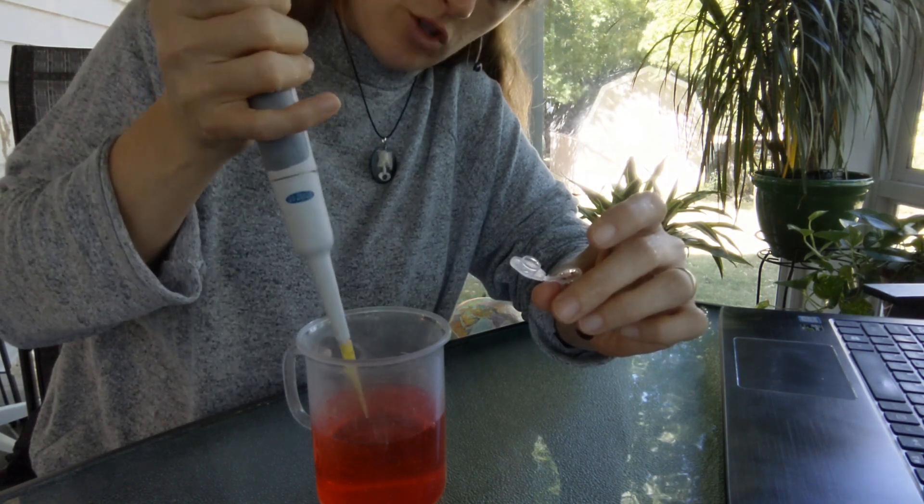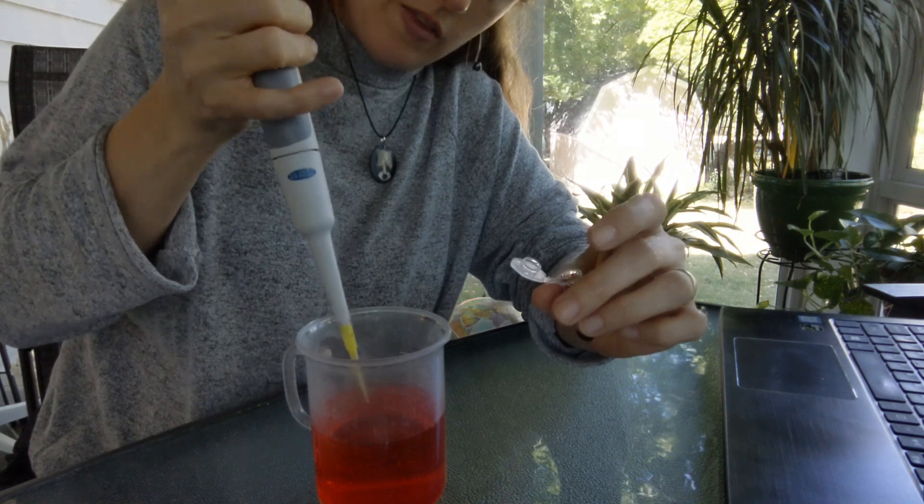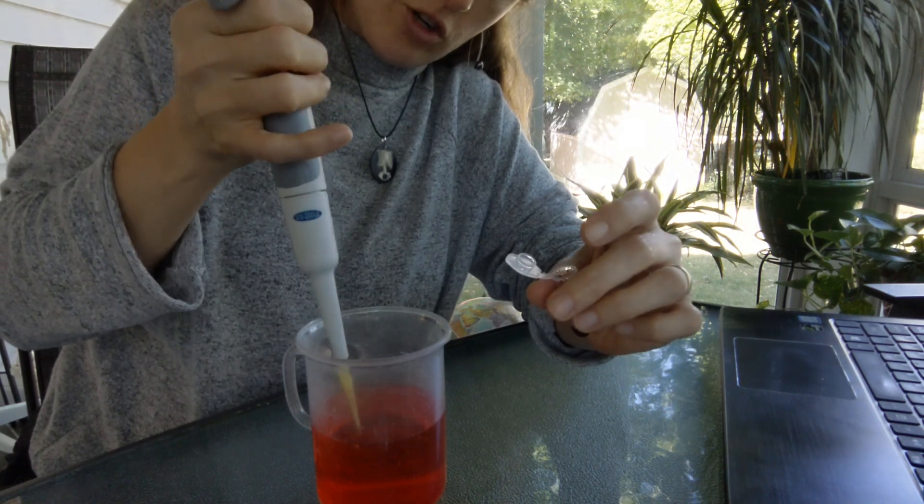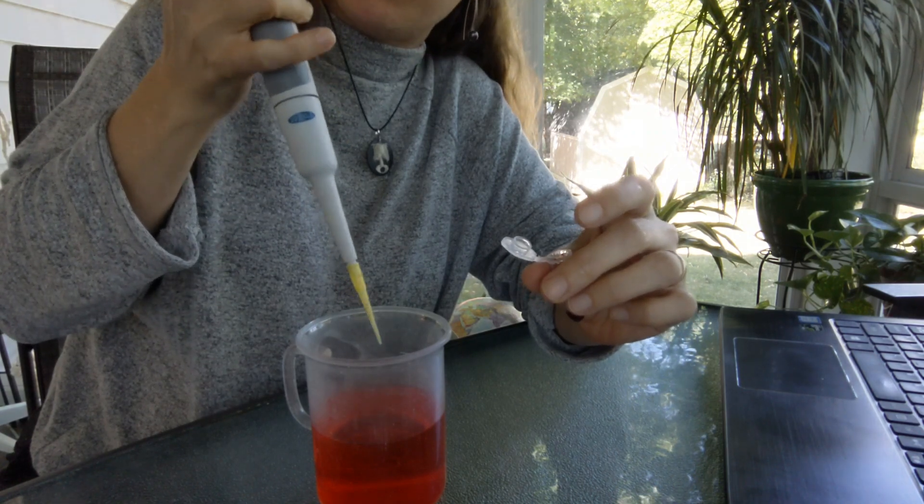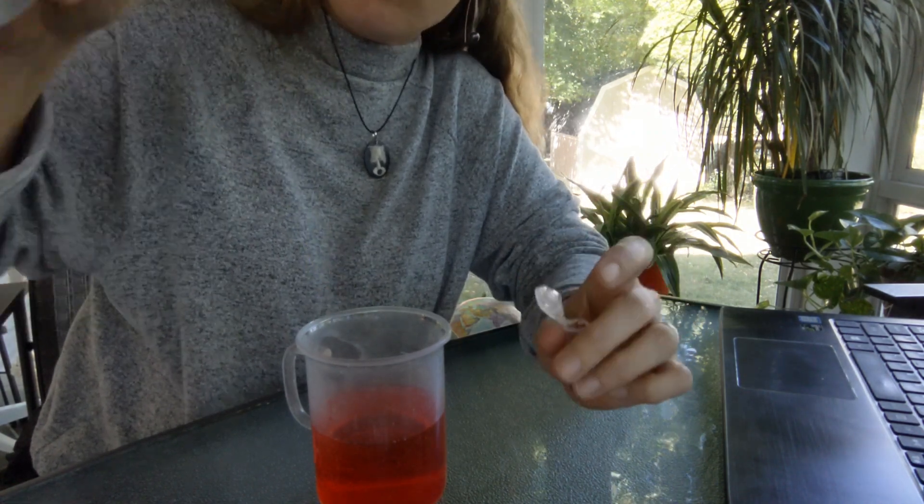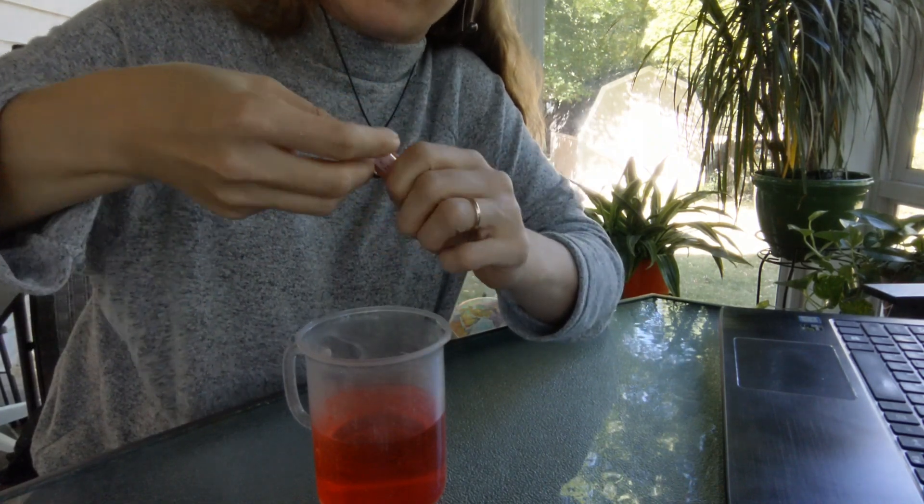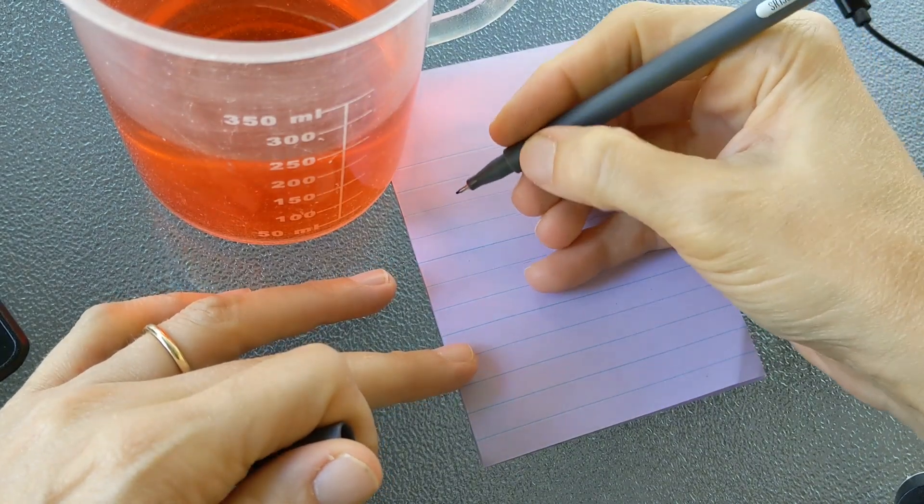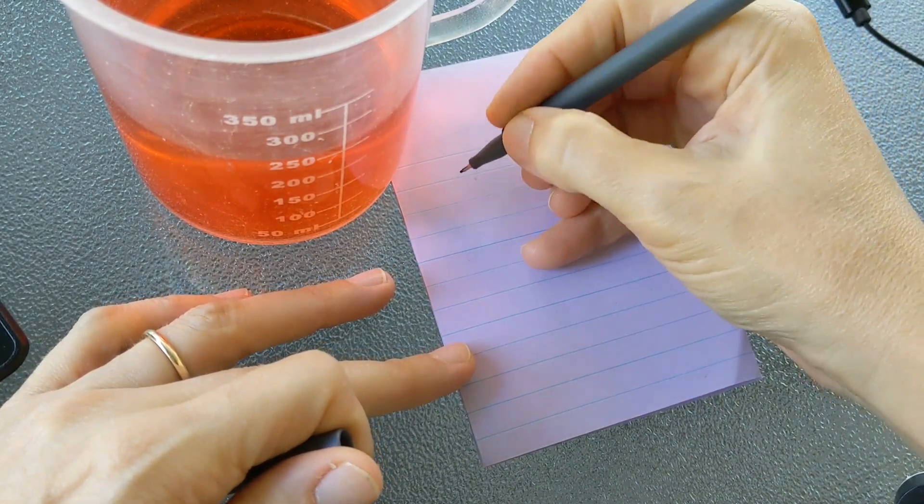So there I really rinsed the tip thoroughly to make sure every single bit of dye ended up in my mystery solution. I could go darker, I could go lighter. There's no right answer to how you make your mystery solution. The important thing is that you know how you made it. The next step is to make your calculation and then hold on to it until you actually do this lab.